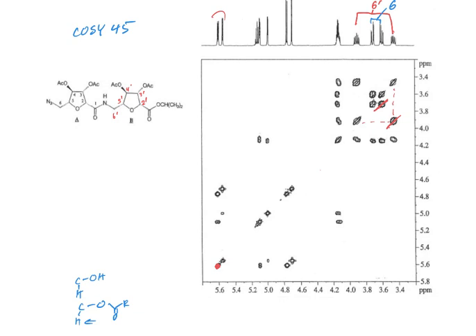Okay, so let's start with 6 prime. So here's 6 prime. And go down here and over to here. So this has to be H5. Right, so we're going to have a 5 prime in here.